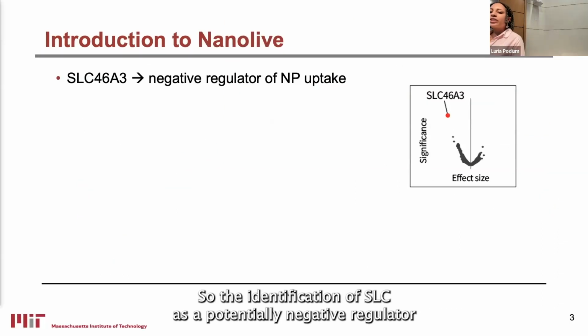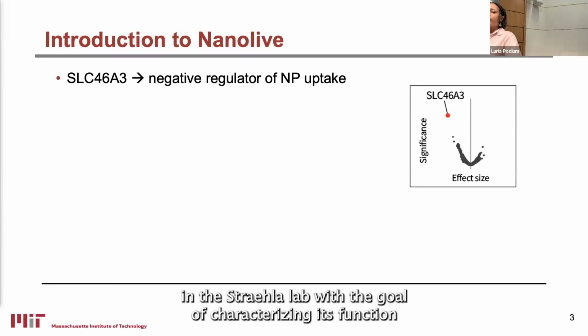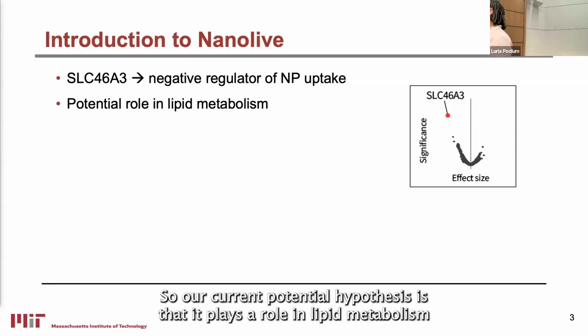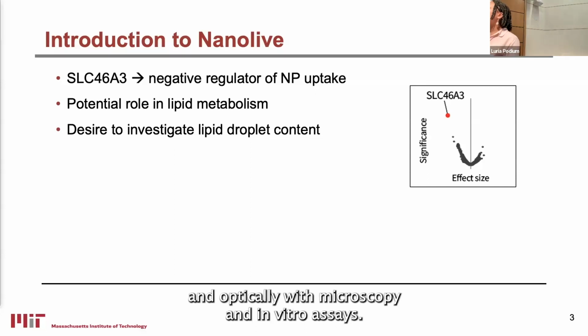So the identification of SLC as a potentially negative regulator of nanoparticle uptake has led to an ongoing project in the Straehla Lab with the goal of characterizing its function, as well as further understanding the role it might play in nanoparticle uptake. Our current potential hypothesis is that it plays a role in lipid metabolism, and we wanted to characterize this both optically with microscopy and with in vitro assays.